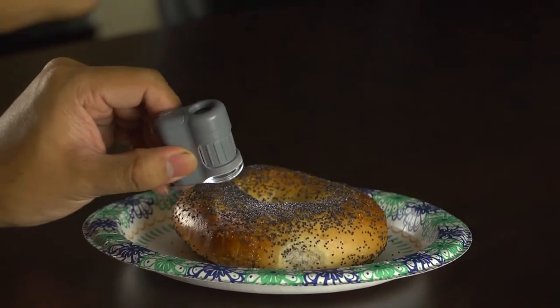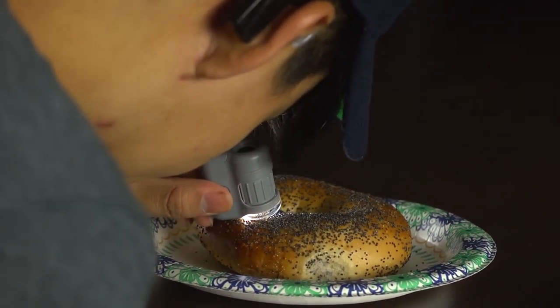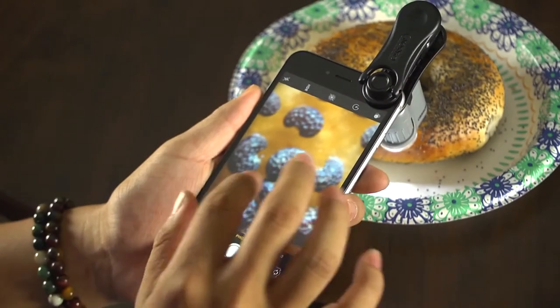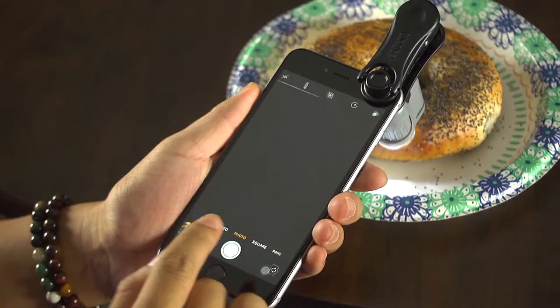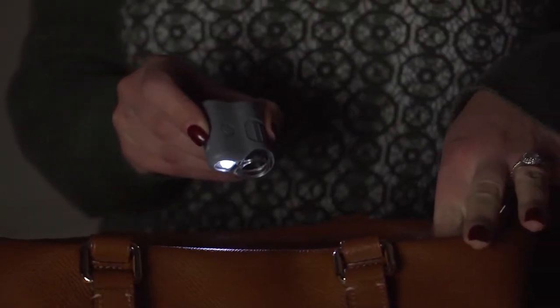With this device you can get razor sharp close up details of almost anything. You can even attach your smartphone and use your camera mode to take all sorts of amazing photos and video. It's also loaded with unique features such as a built-in flashlight and UV light.